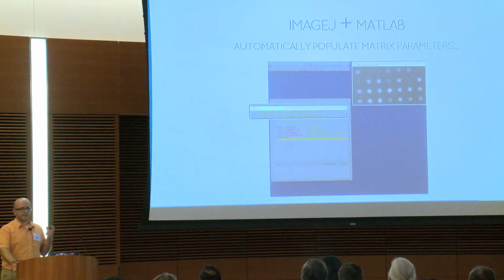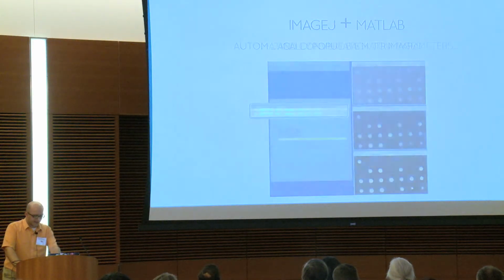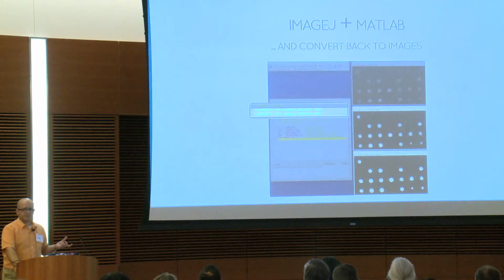Curtis talked about them in the context of modules, and you can also use them inside of the script editor. So here is an @matrix, and that's something special provided by ImageJ+MATLAB that's saying, I have a data set, and I want a MATLAB matrix. Just by declaring that as an @matrix, the framework uses the converters behind the scenes and does everything implicitly. In the other direction, because this is a MATLAB script, it doesn't know about ImageJ2 data sets, but by telling the framework that we want these matrices out of the script as data sets, those converters will be called again, and the whole script framework will automatically convert them back to data sets and then display them.